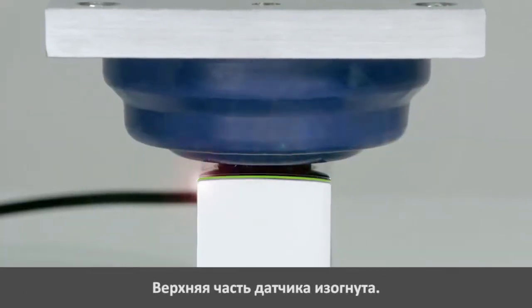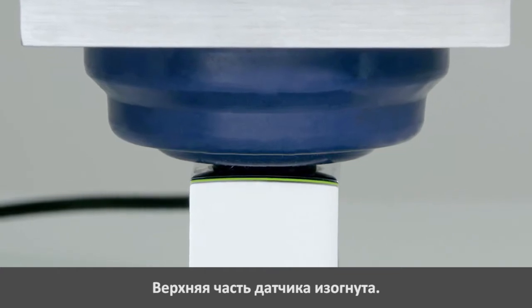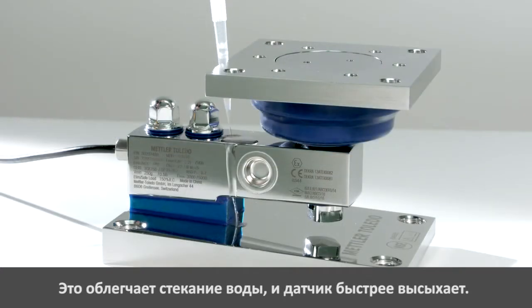The upper part of the load cell is curved. This speeds up self-draining and reduces the amount of time required for drying.